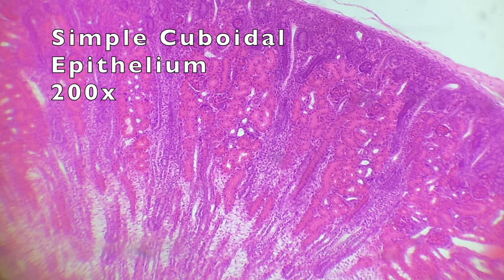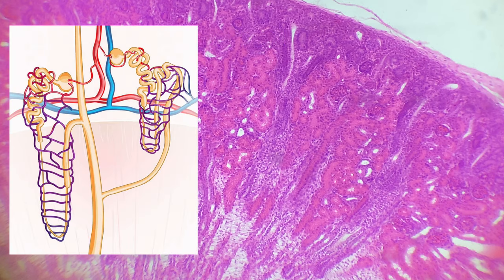This is what's called a nephron. I'm going to put a diagram of a nephron to show you a little more clearly what's going on. We have, for example, a proximal convoluted tubule, a distal convoluted tubule, a loop of Henle, and a few other things. This is where all of that filtration I was talking about earlier takes place inside this matrix of cells, and it's also where we find the simple cuboidal epithelium — it makes up the walls of this pink layer.